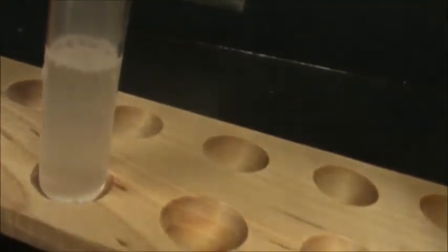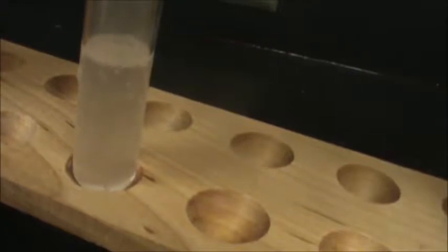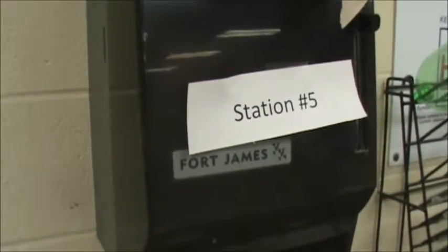So you can totally see that we have gas bubbles going like crazy now. It looks like fizzy water, filling up that test tube full of gas. And we notice that there's still liquid sitting at the bottom of the test tube. So think about the products that could be possibly coming from this reaction. Alright, the next reaction, station number 5.